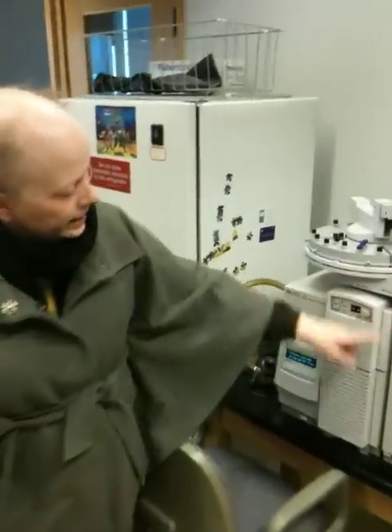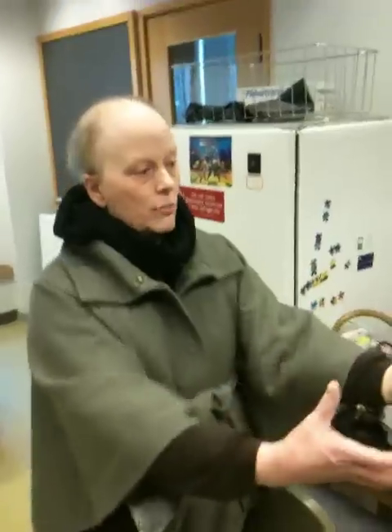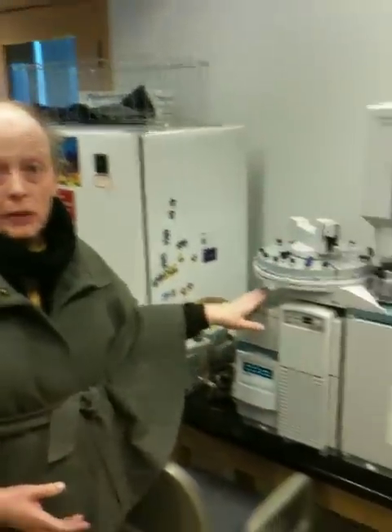What makes the big difference with this instrument is it has a different detector — a very, very special detector right here. This detector is a mass spectrometer. What happens is, as soon as your sample comes off the column, it goes right onto this mass spectrometer. The compound is bombarded with an electron beam that basically destroys the molecule. The molecule gets hit with electrons, electrons are ejected, and it becomes a cation. Then that cation just starts to fragment. What's really interesting about organic molecules, and you're going to learn about this this semester, is that organic cations fragment in very characteristic ways. There are mechanisms for this kind of high energy chemistry.